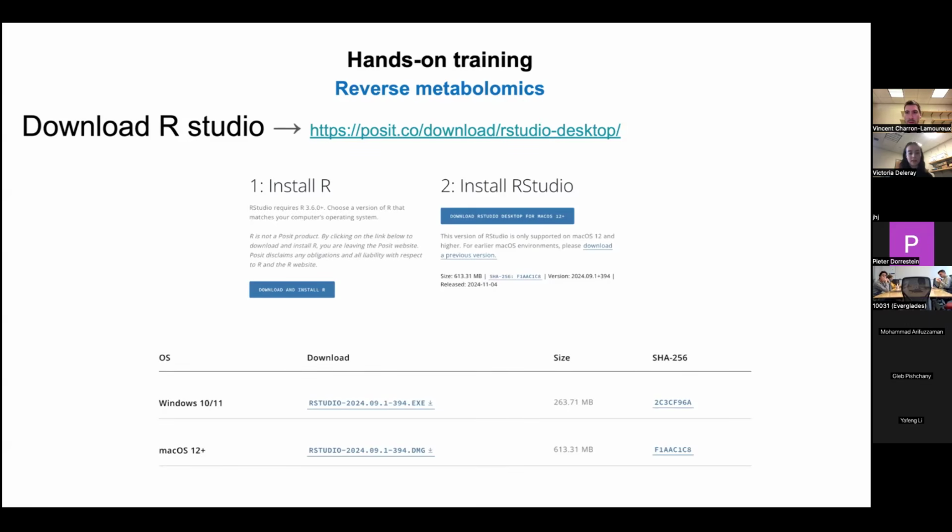Okay, I think that means that everyone has RStudio. So go ahead and open that up.